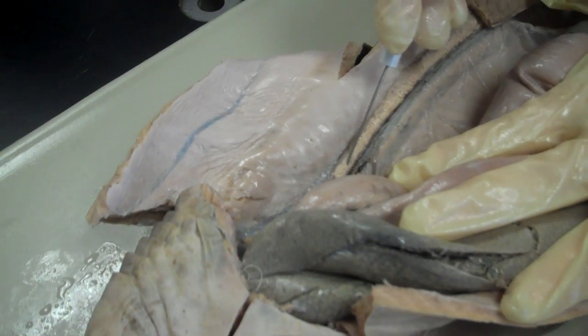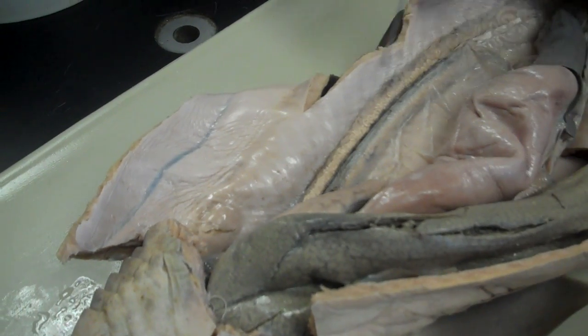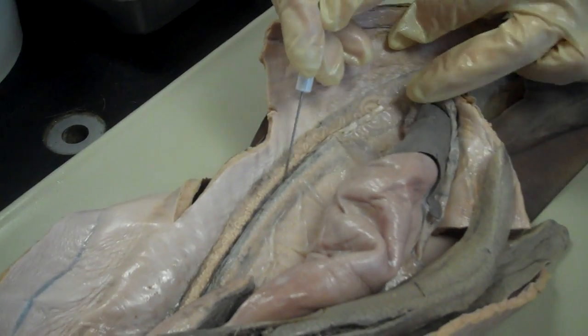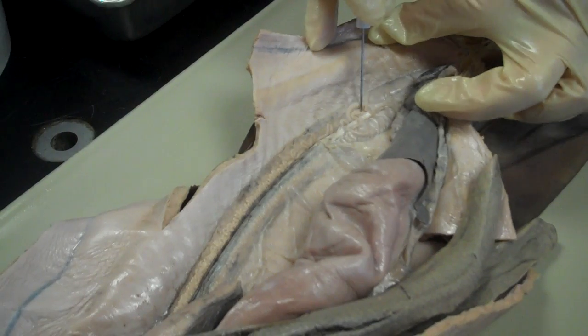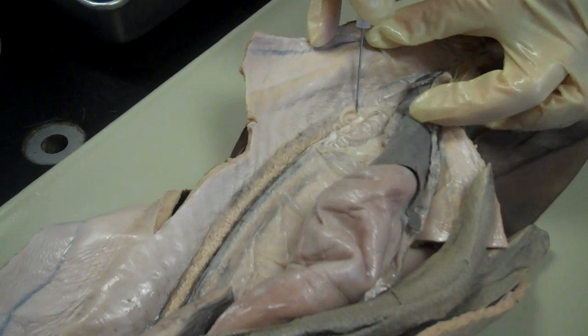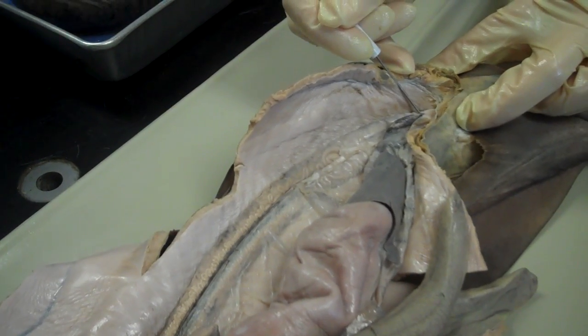Then the sperm travels down these little coiled up tubules. This is the vas deferens. As you get farther posterior in the shark, the tubules end up getting larger in diameter and becoming more straightened. So this would be considered the seminal vesicle here, and that leads down to the sperm sac here.